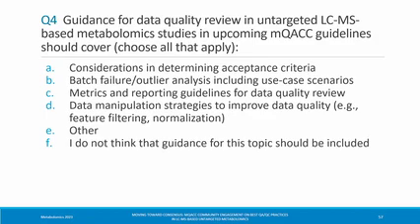We do a lot of lipidomics, and I think our other lesson has been that we find the lipid splash just incredibly useful as a reference material, just to check performance, to quickly eyeball that we're actually seeing those same peaks across a run, and nothing has gone disastrously wrong in the night when we're running LC. So those are the two things that we picked up in the lab on a day-to-day basis. Very good, thank you.